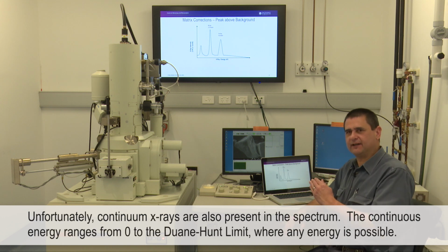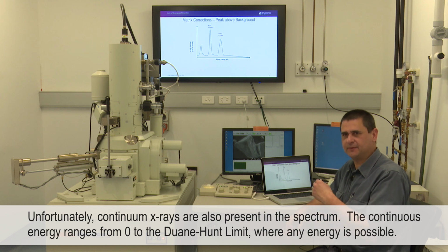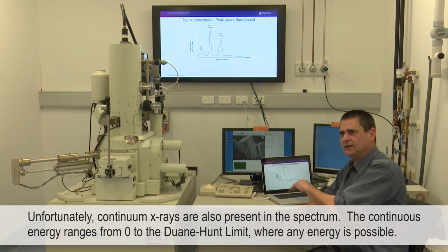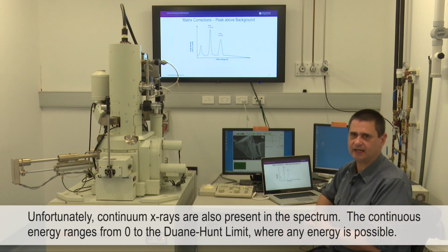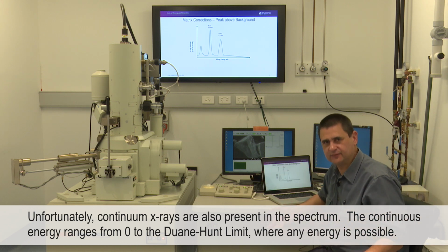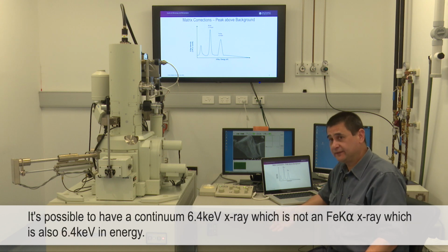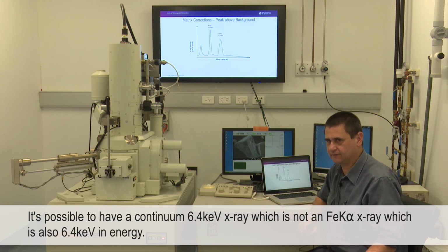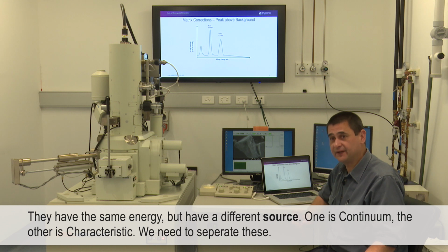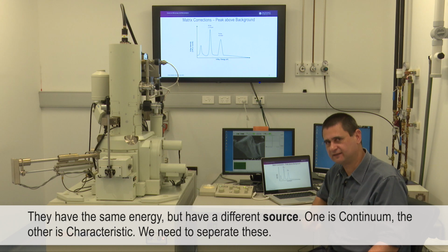Unfortunately, I also have present continuum X-rays. And remember, it's called a continuum spectrum because it's got a continuous energy between basically 0 to the Duane-Hunt limit where any energy is possible. And so it's quite possible to have a continuum 6.4 keV X-ray. However, a continuum 6.4 keV is not an iron K-alpha X-ray, which is also 6.4. They have the same energy, but they have a different source. One's continuum, one's characteristic. We need to separate that.